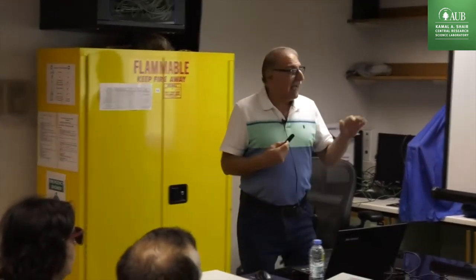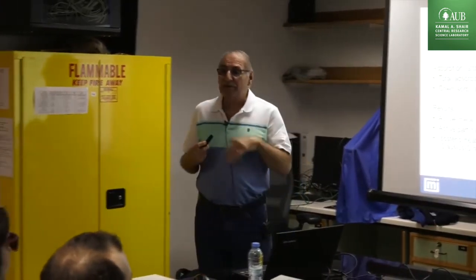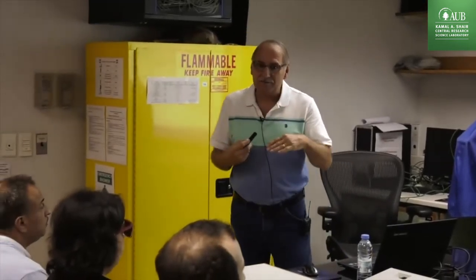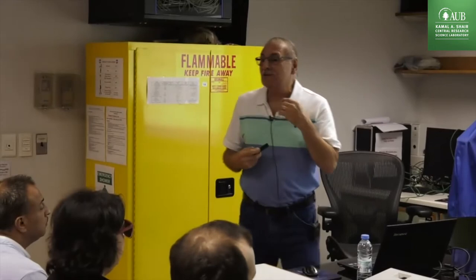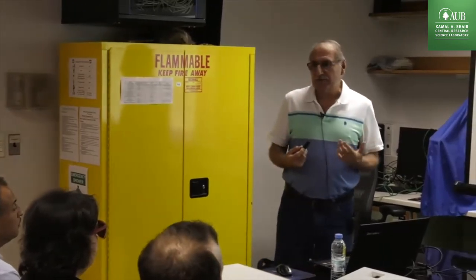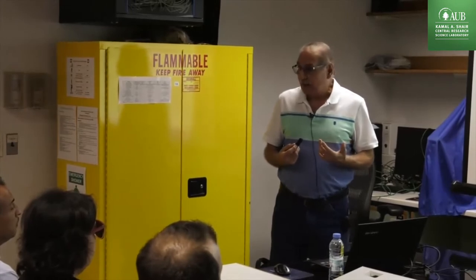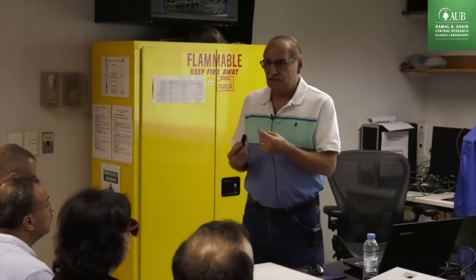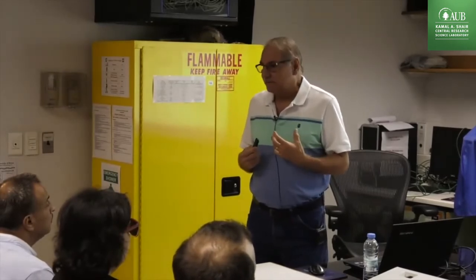Okay? So for any kind of catalyst, if you have more than 50% dispersion, meaning more than 50% of active species accessible on the surface, it is considered to be a good catalyst. But if I get, for example, 10% or 5% dispersion, you've lost your time. I can give you a small example. If you're preparing a catalyst with platinum, for example, platinum is very expensive.